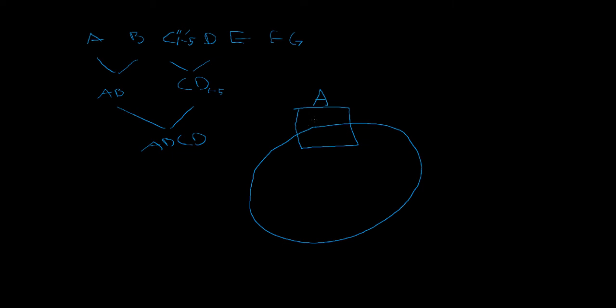Now, this part can be whatever, but there are a few rules for this part. This part cannot have an EcoRI site. It cannot have a BglII site. It cannot have a BamHI site. And it cannot have a XhoI site. These are the off-limits enzymes, so don't use these enzymes.